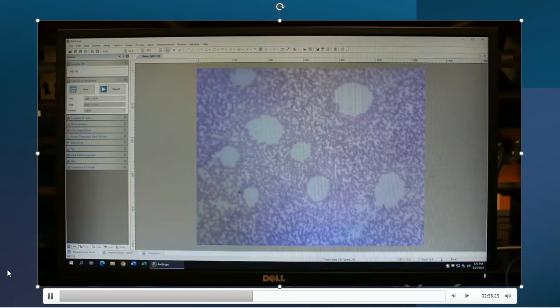Now that I see something that kind of looks like that, I'm going to go over to the platform and start to slowly pull back away from the lens. Remember, me personally, I like to do the platform all the way up to the top as much as I can, and then I like to back away from it slowly. I think that I get the picture a little bit faster by doing that.